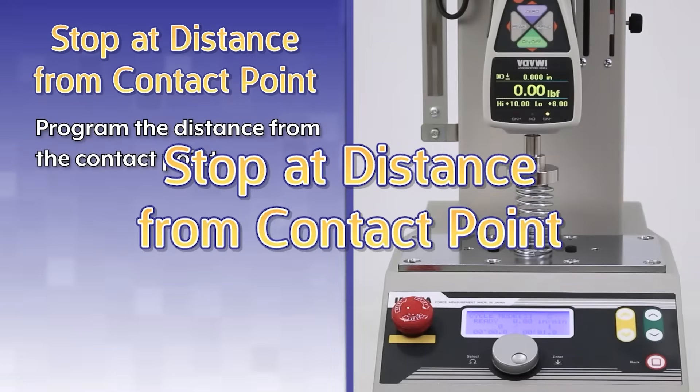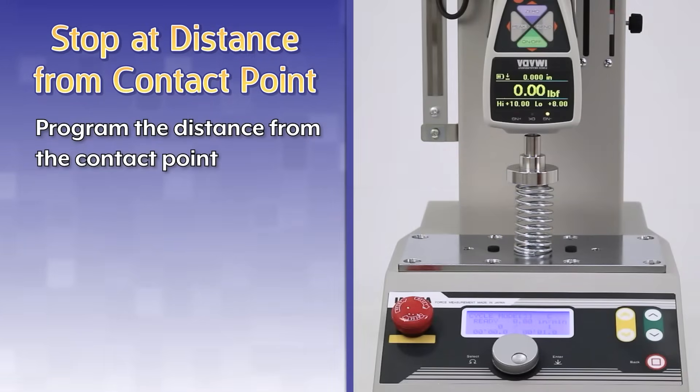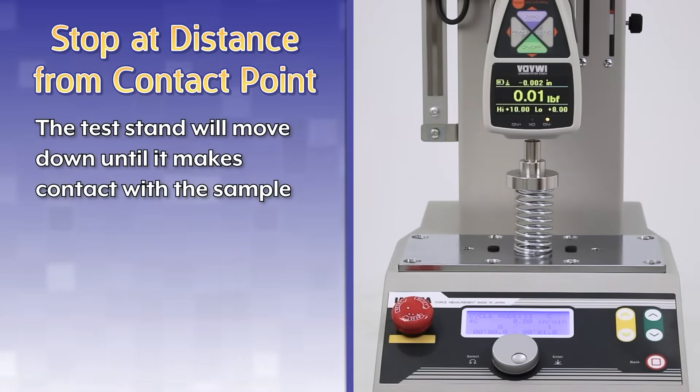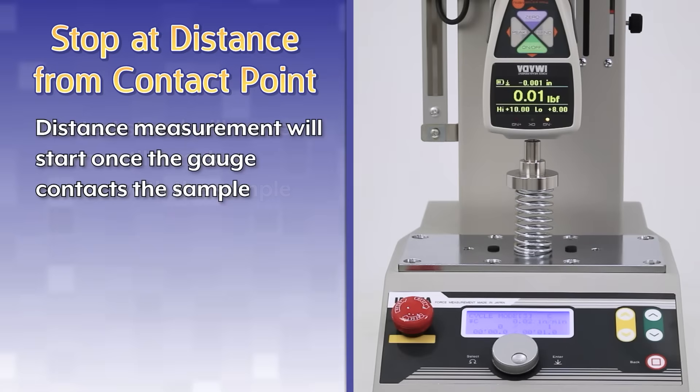Stop at distance from contact point. Program the distance from the contact point. The test stand will move down until it makes contact with the sample. Distance measurement will start once the gauge contacts the sample.